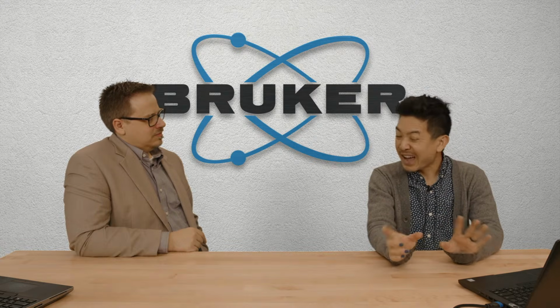Yes. And if time were no object, if teaching and education were no object, then areas are technically what I would prefer, because one of the things we don't really have time to get into is crystallite size broadening. As a material gets smaller and smaller crystals, so as you grind it more, if you're working with nanoparticles, your peaks actually get shorter and wider. The shorter, wider peaks take the same amount of intensity and smear it out over a wider 2 theta range.